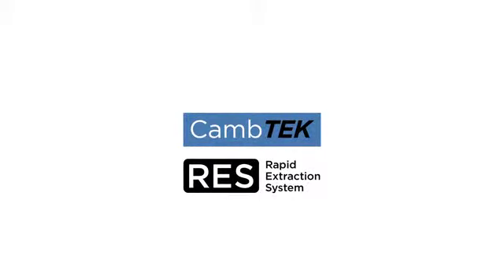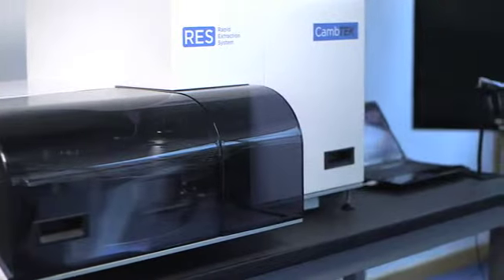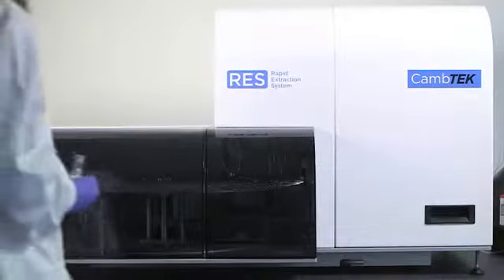The Camtech Rapid Extraction System delivers precise, rapid, and reliable automated sample preparation of solid dosage forms prior to testing.